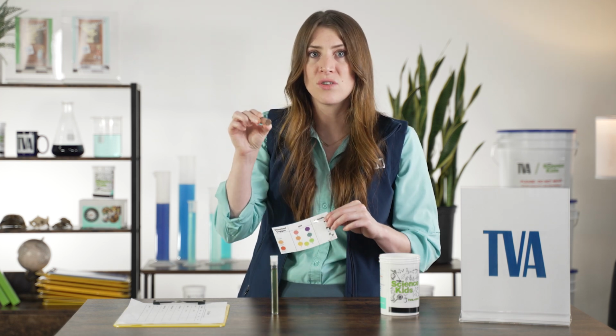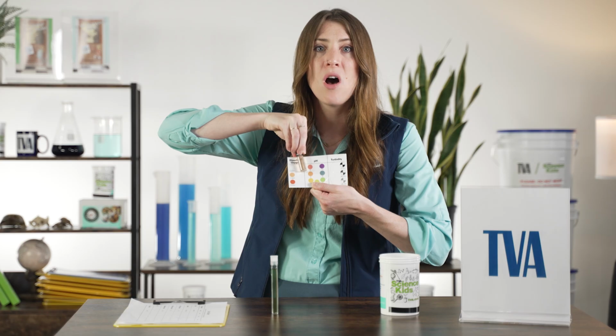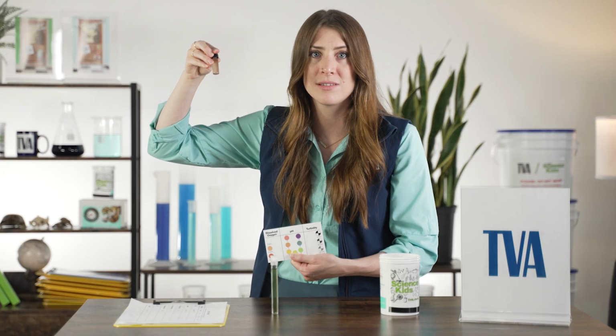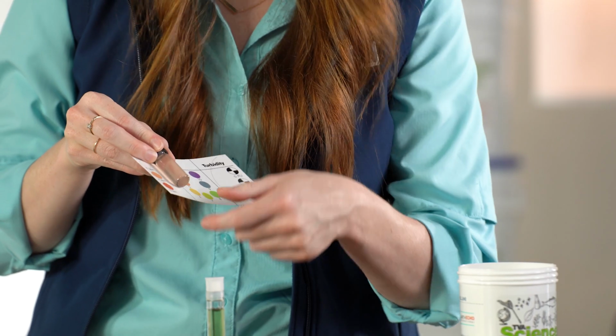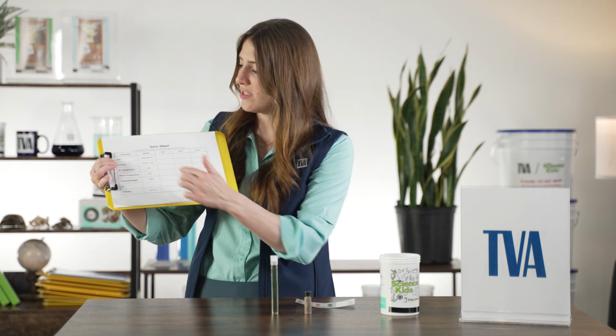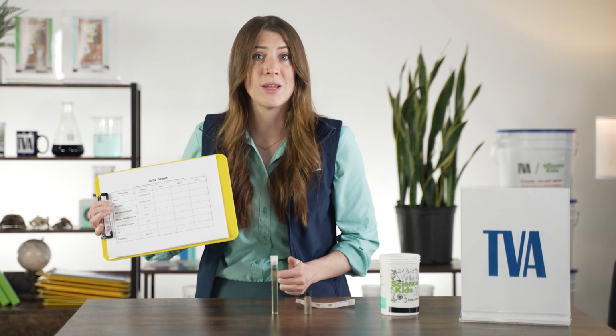Take your dissolved oxygen vial and place it on the comparison card under the dissolved oxygen segment. When you're analyzing color, it's important to always hold it up on a white background or hold it up to the light to see accurate results. Decide if the color inside your vial is closer to 0, 4, or 8 ppm. If you're working in a group, be sure you discuss and decide together. Then record the dissolved oxygen on your data sheet under your dissolved oxygen section using your units of measurement.